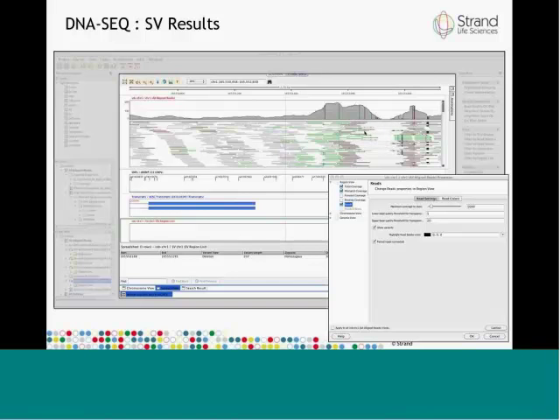If you notice, there is also a color difference between the reads that overlap this deletion and the reads in other locations. Most of the reads here are light gray, and most of the reads in this region are a dark grayish color.